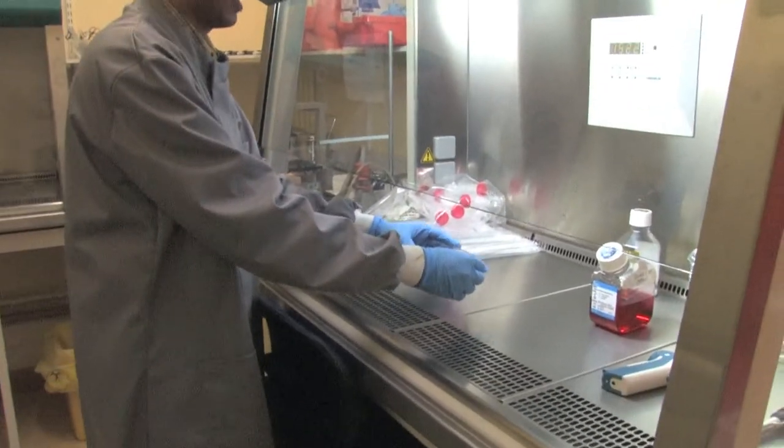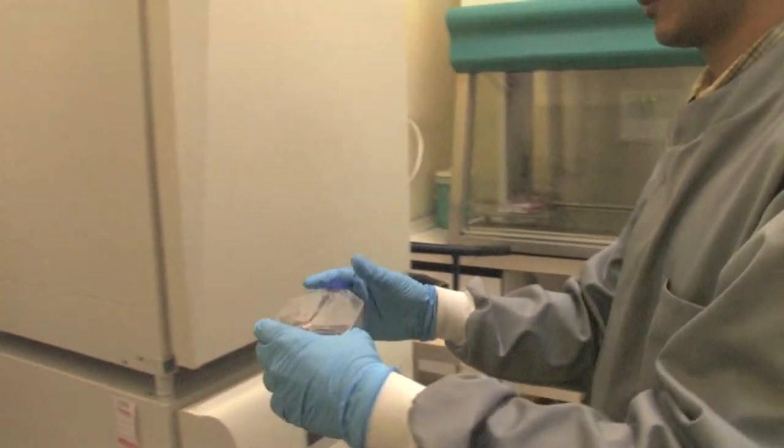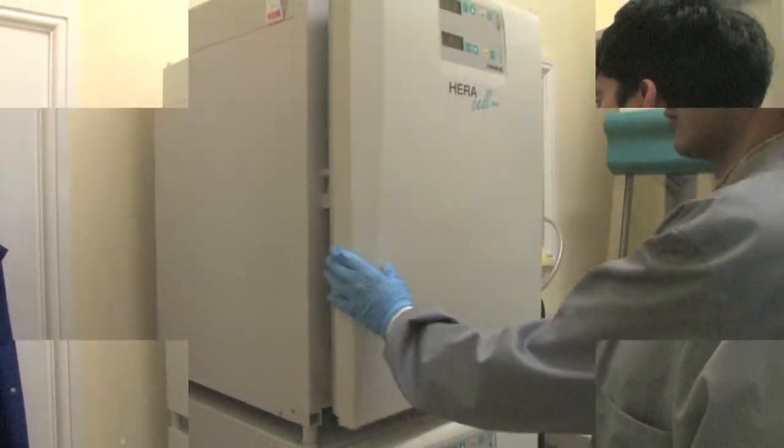The flask is then placed in the incubator. The incubator is set at 37 degrees with humidified atmosphere of 5% CO2.